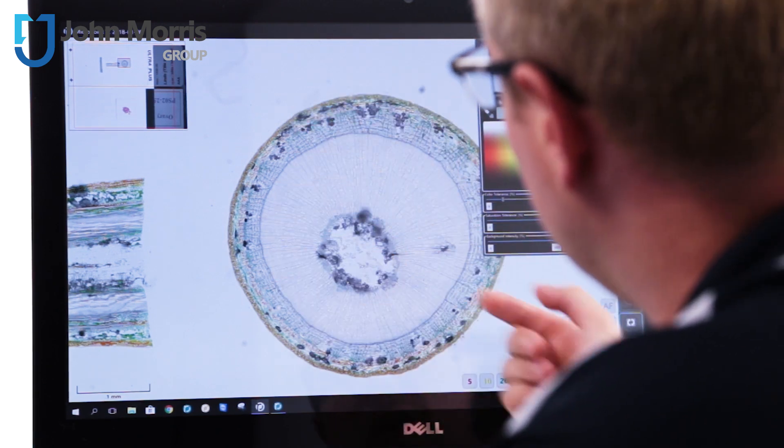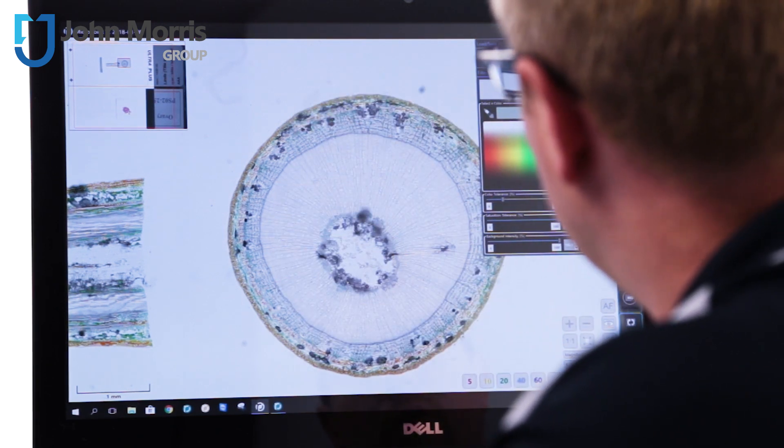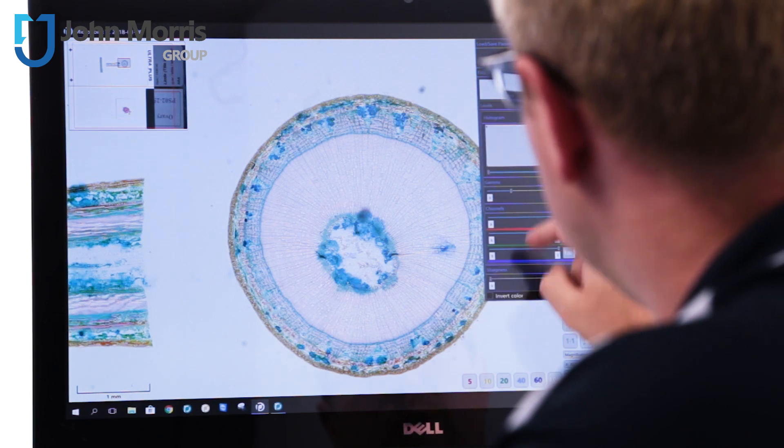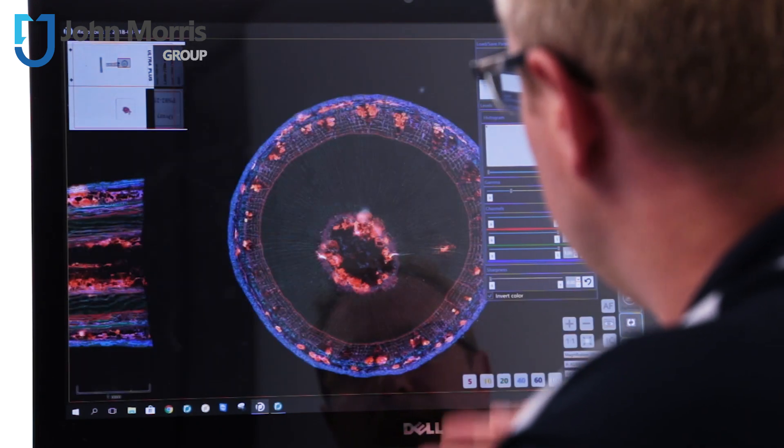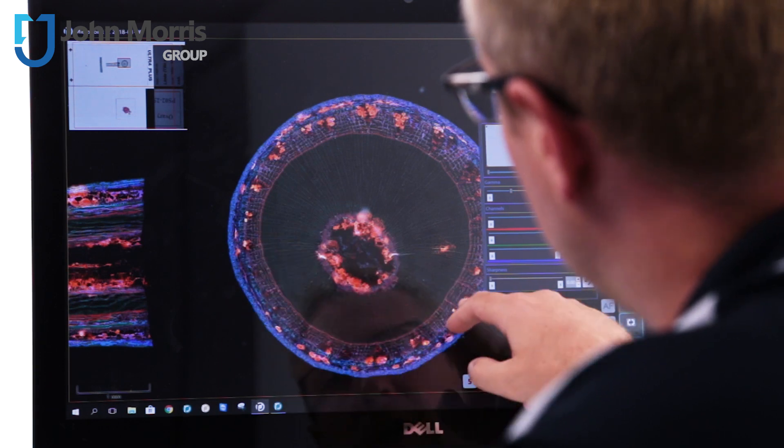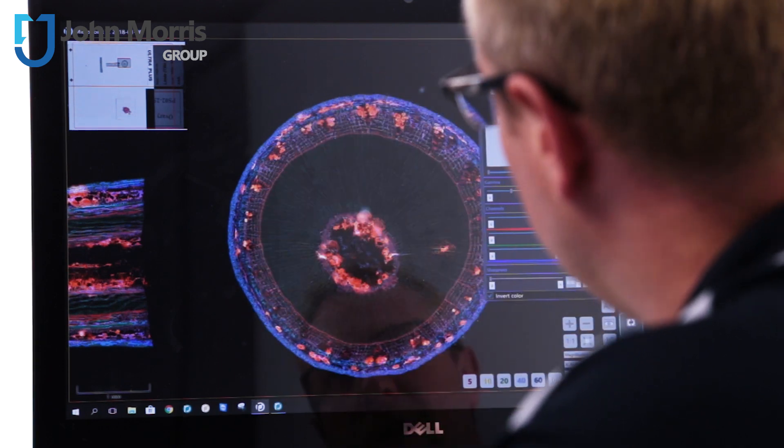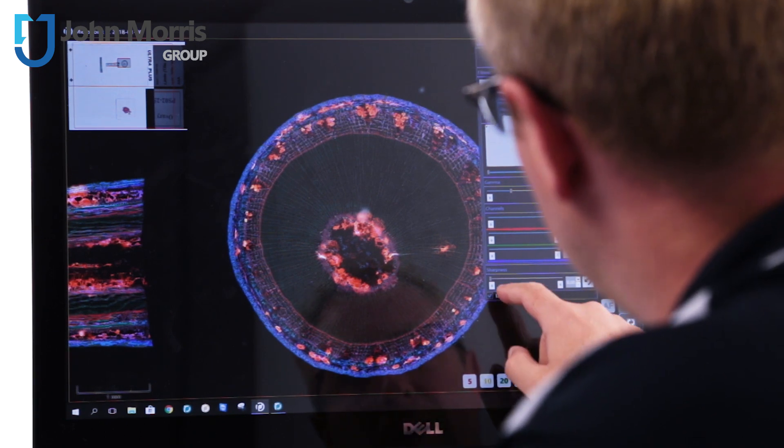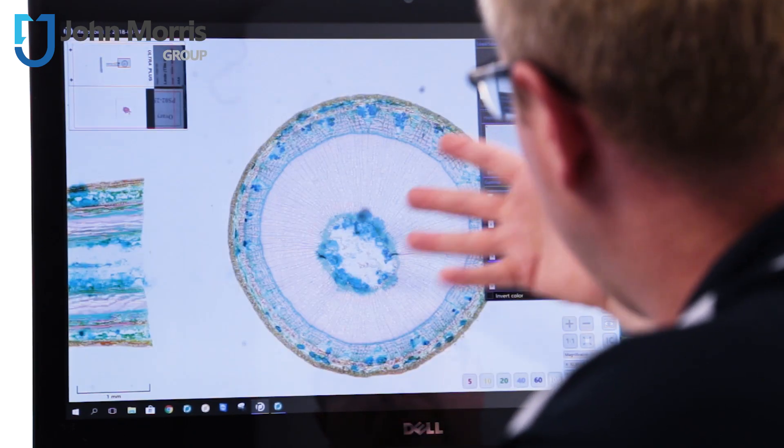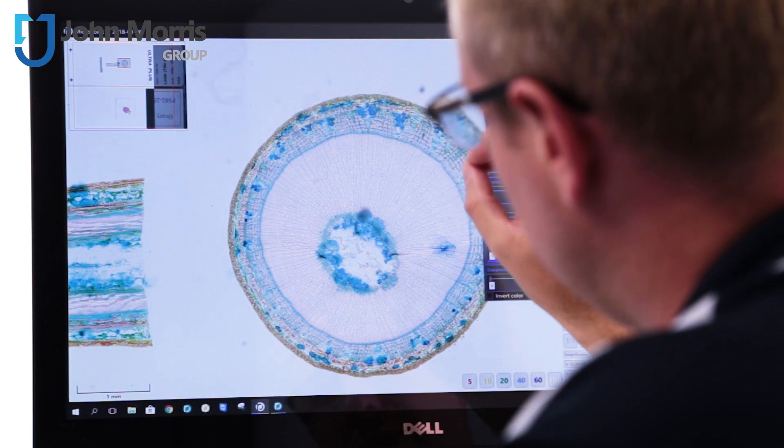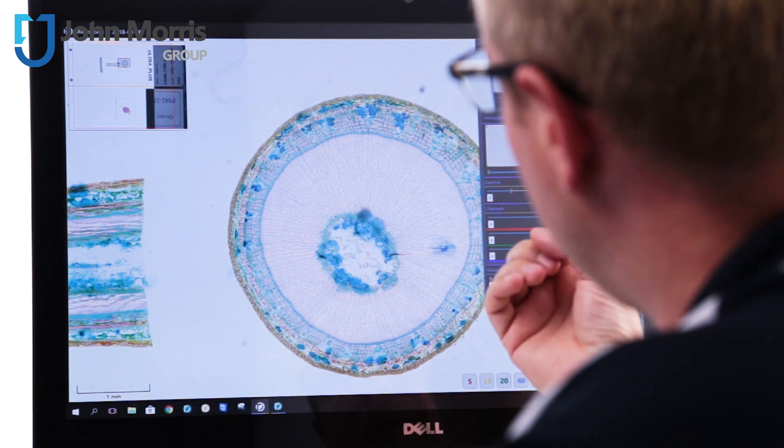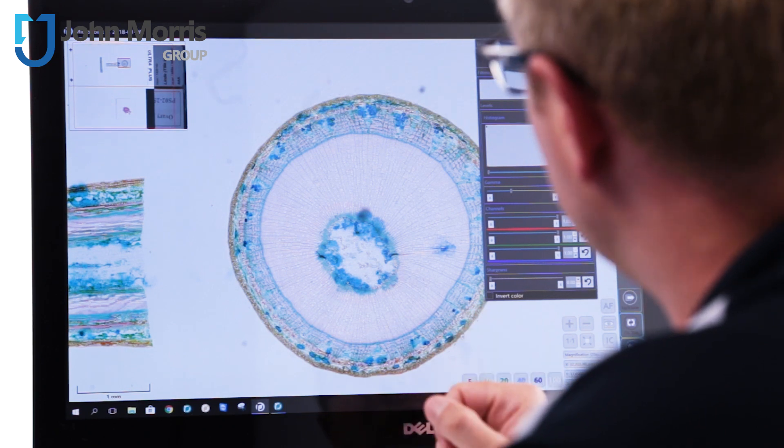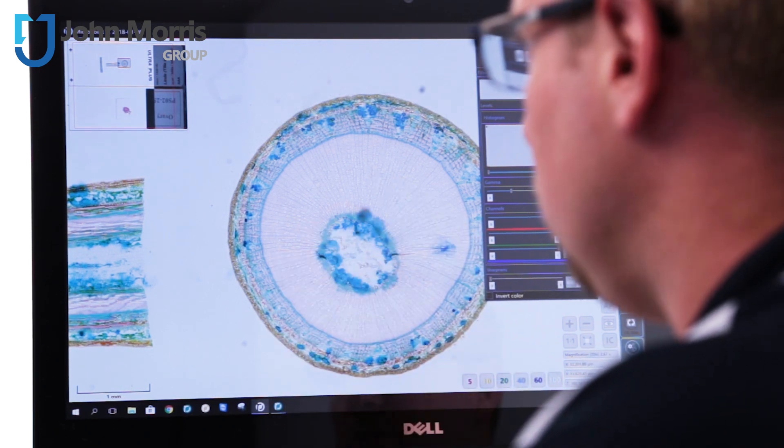So that it highlights the area that we're actually interested in, or alternatively what we could do is we can go for a level adjustment and we can invert the colors to see where the stains, the staining may have actually congregated or been absorbed to a greater amount. So we can do quite a lot here to actually play with the image to make things either more obvious or more vibrant or even hide things that we don't want as distractions and that's a really useful feature.